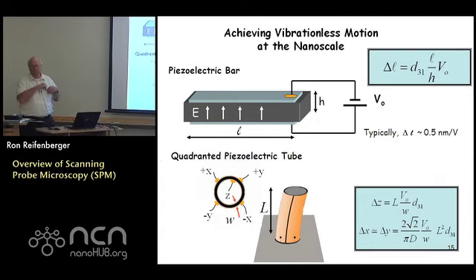So what you need to do is build a system that you don't have to touch, but you can control positions. And of course, the way to do that is piezoelectricity. I don't know if you've studied this yet in your courses, but it's an amazing effect. It was discovered in the late 1800s.